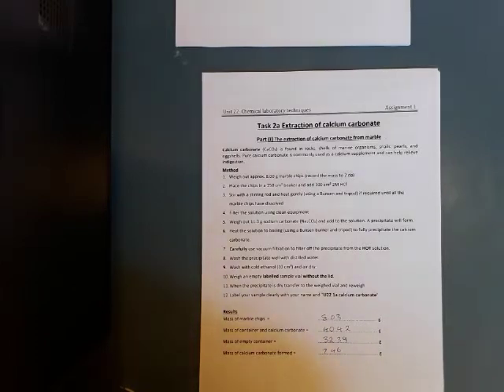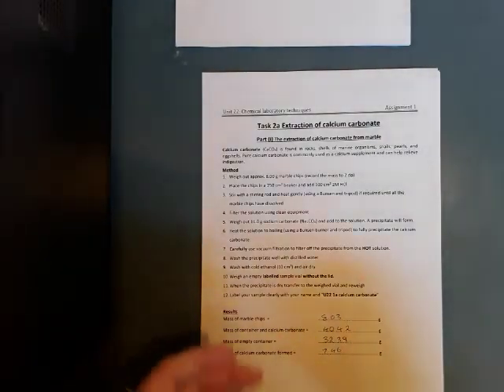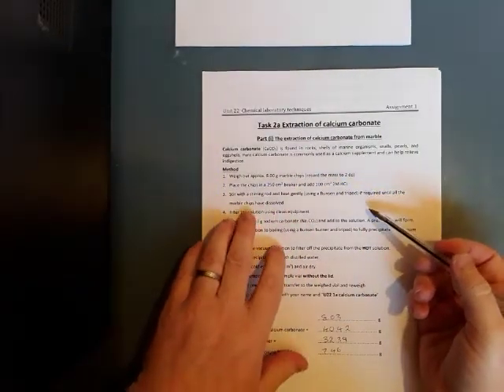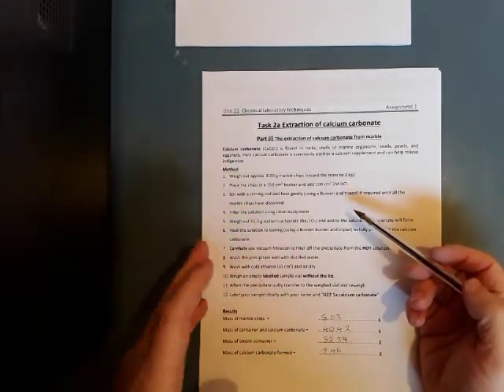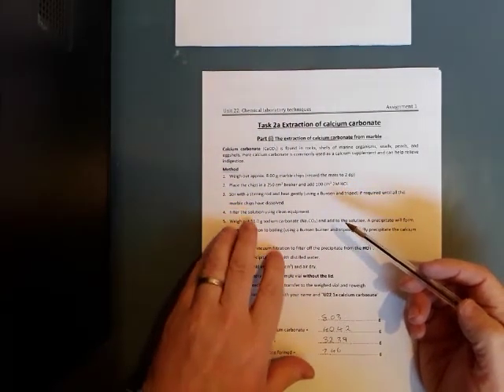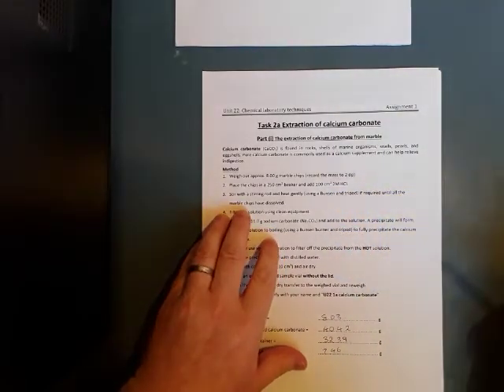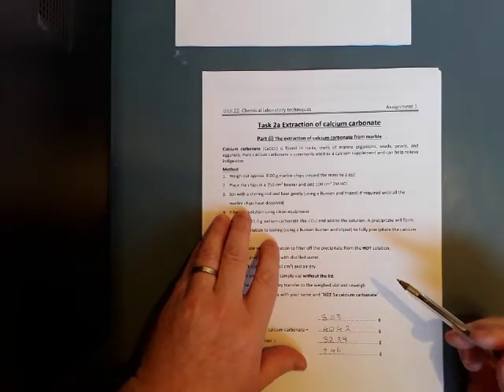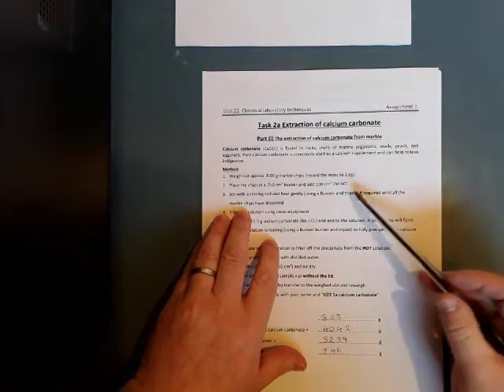When you do this practical, sometimes we don't always get everything dissolving straight away. We're heating it gently until all the chips have dissolved, and this can take some time depending on the size of the marble chips. So an issue there, in stage number 3 to get the marble to dissolve, is that potentially it takes a long time and some particles are left over, which we have to filter. An improvement could be to use a powdered form instead of chips. Larger surface area, it'll react a lot easier with the HCl. So there's a thought there.